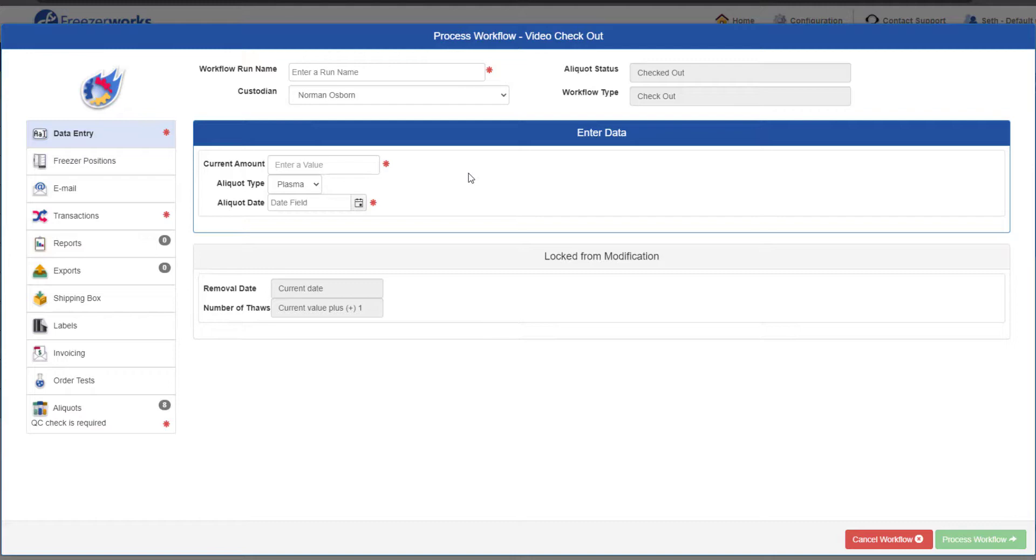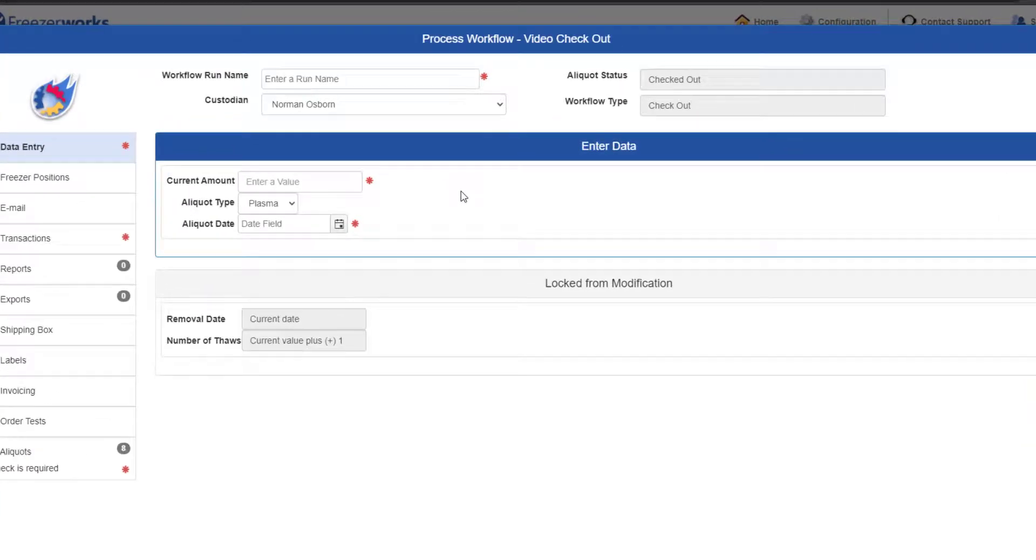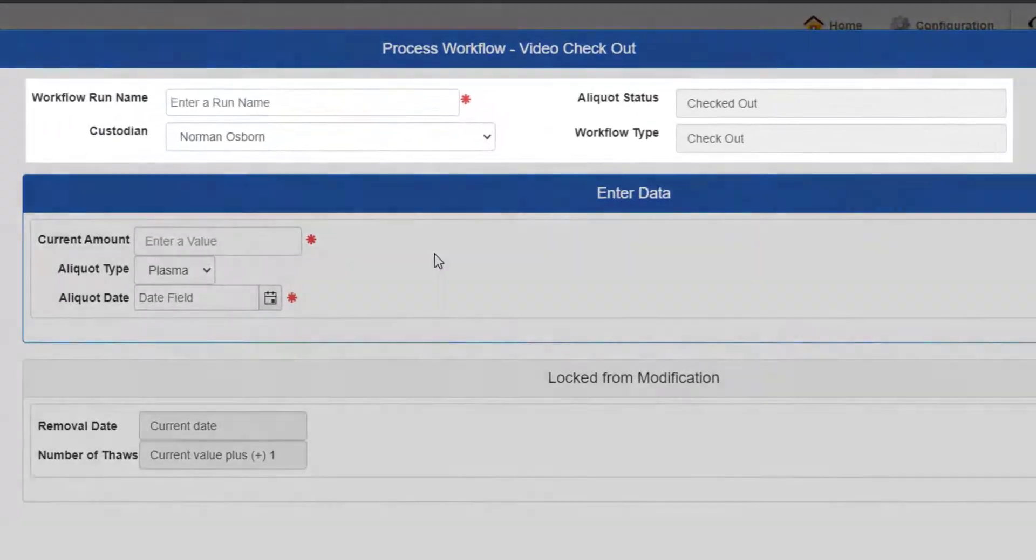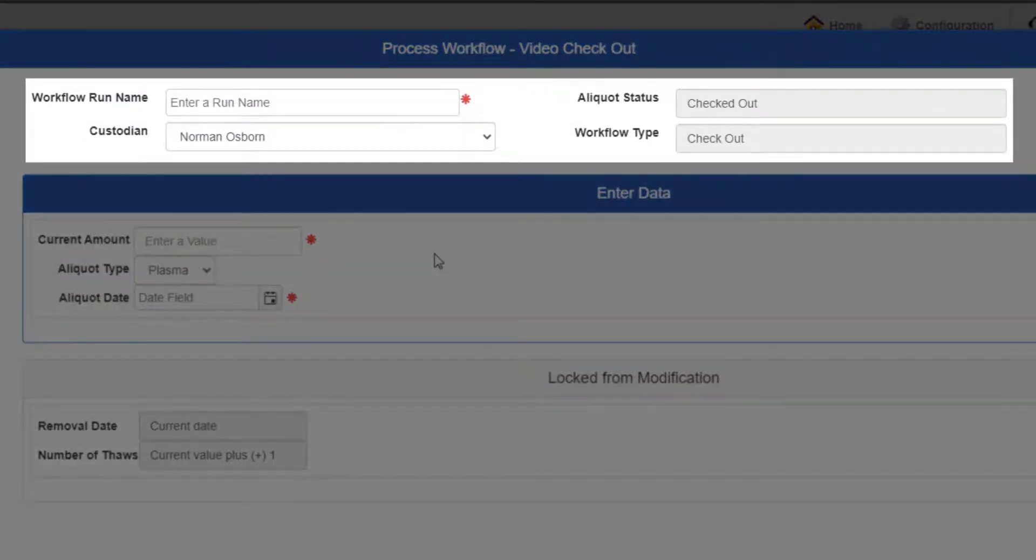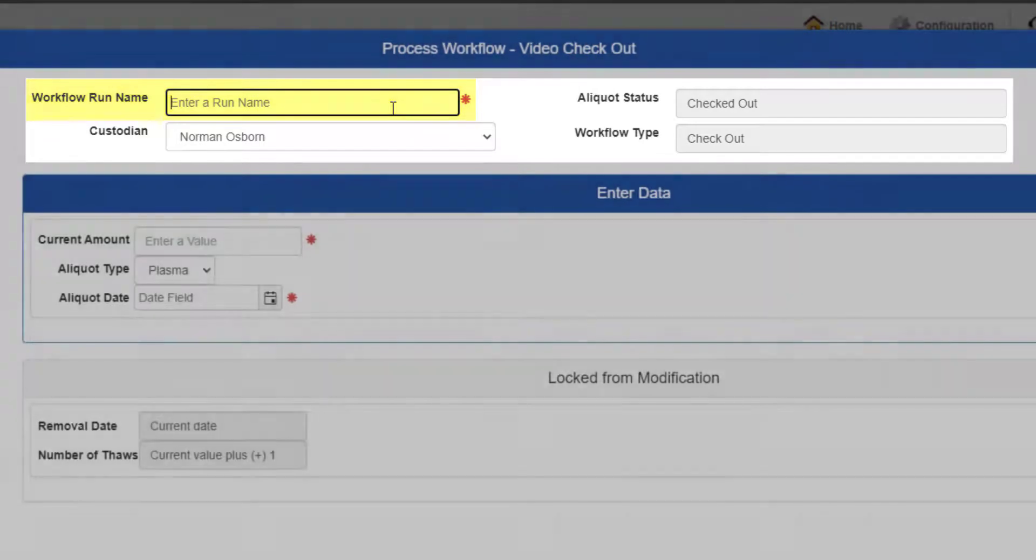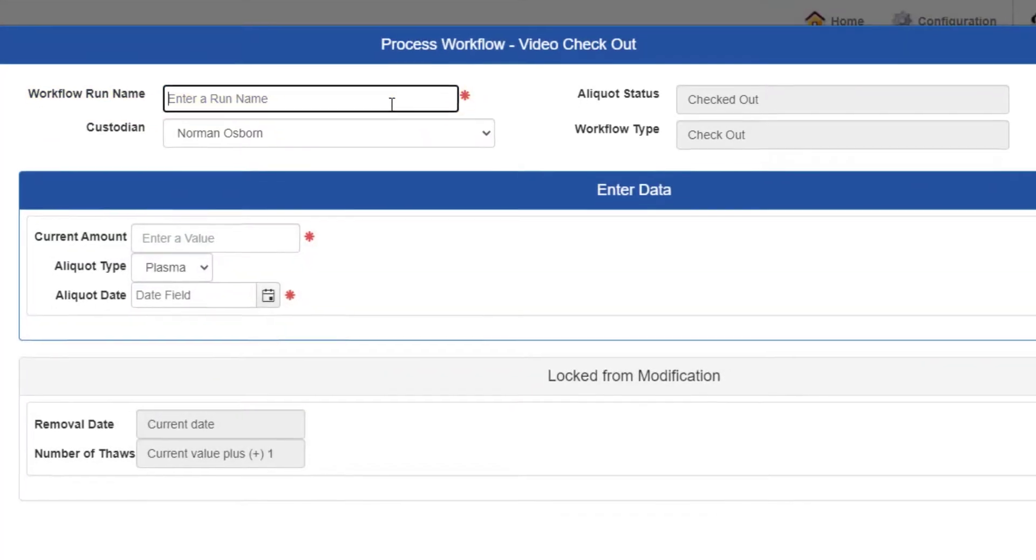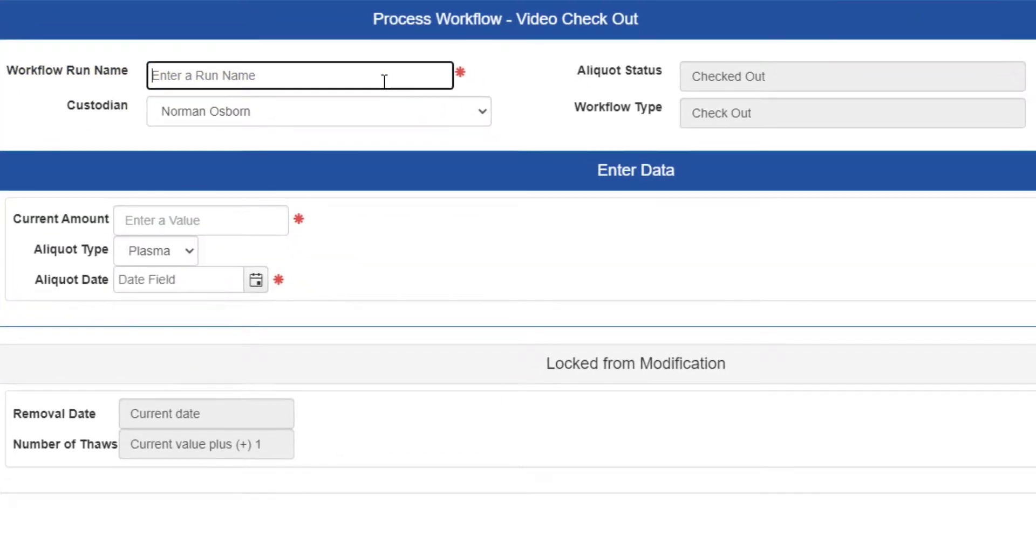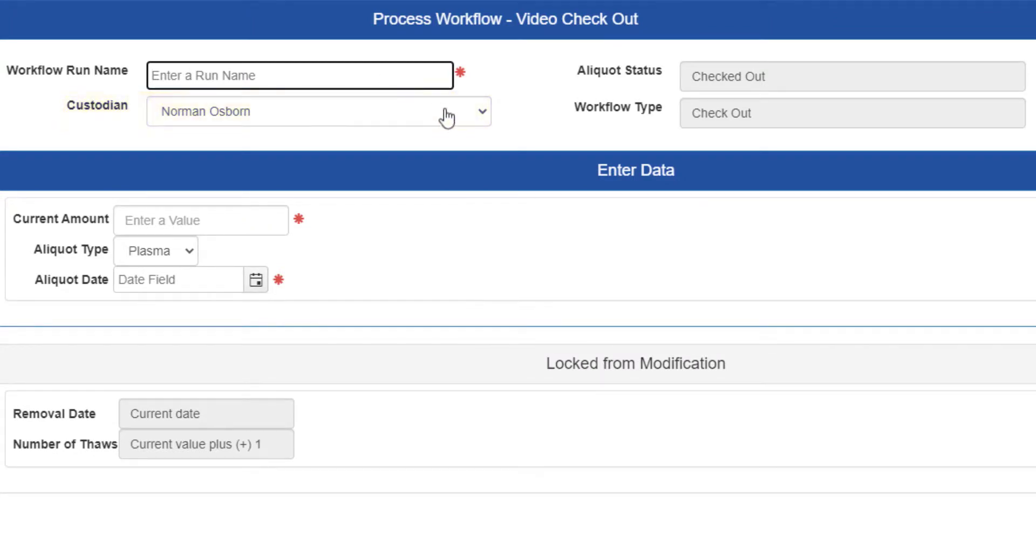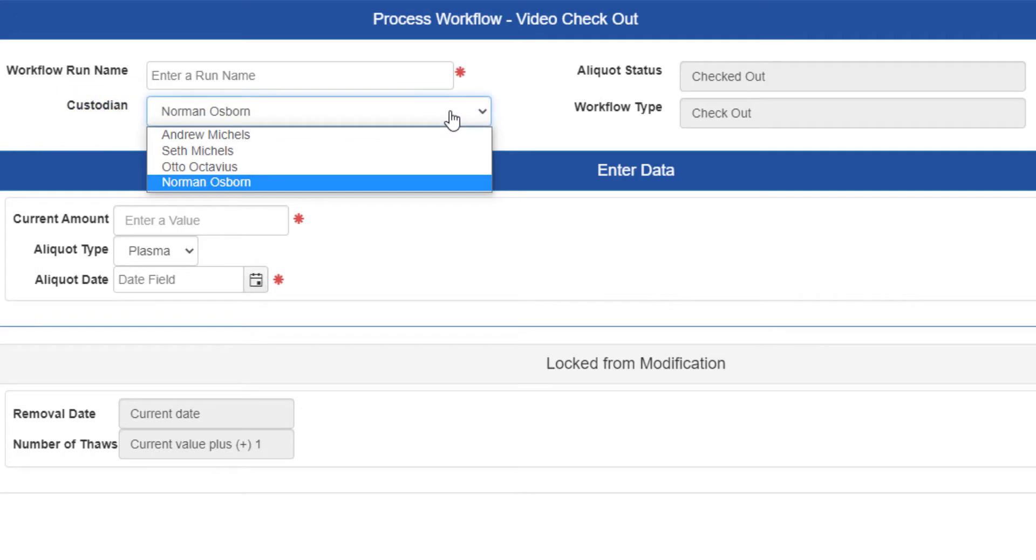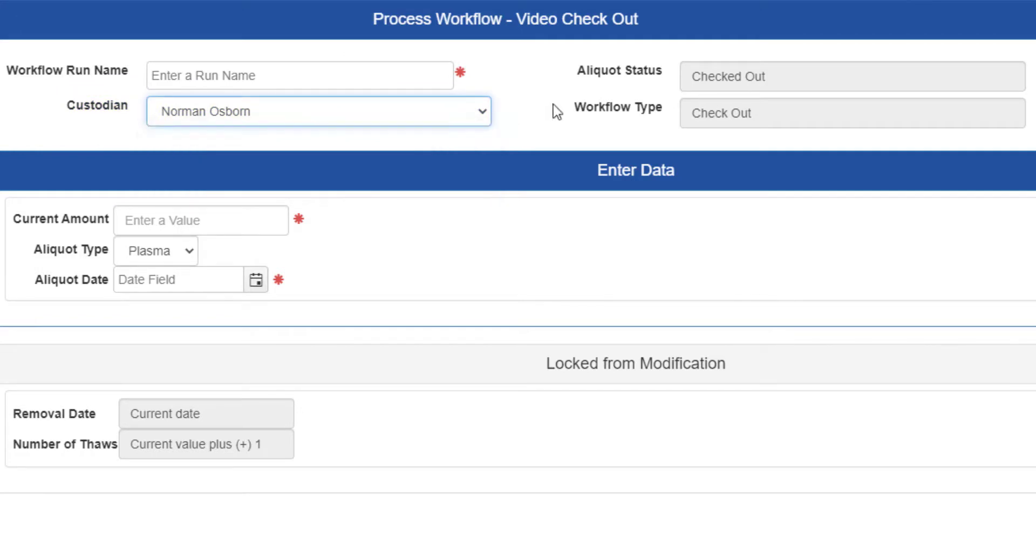So, you want to start any workflow type by looking at three things. First, the top portion of the form where you can enter a workflow run name, which helps you and others identify workflows and workflow history. This field may be required in your template, but more on that in a second. You'll also find the custodian field, which is purely informative and doesn't change an aliquot's attributes or security like the owner or aliquot status. Speaking of, the aliquot status is listed here but it isn't modifiable during processing.